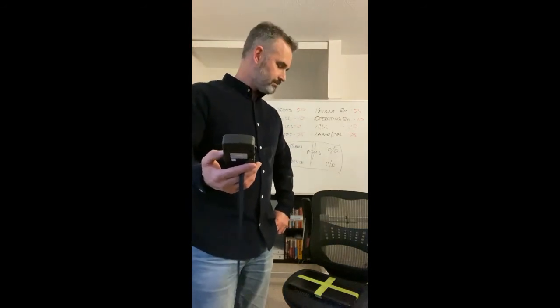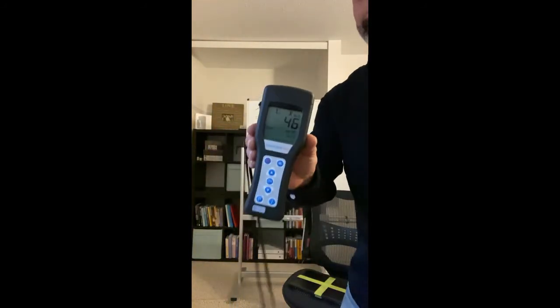I suspect that we're going to be, well, obviously better than the sanitize only section. So we actually got a 46. So disinfecting only, we are not much better than cleaning only. Now, in terms of disinfecting, if we are to truly disinfect a surface, if we don't clean that surface, we cannot disinfect it.